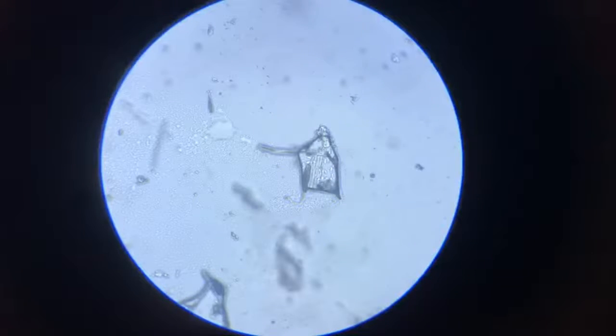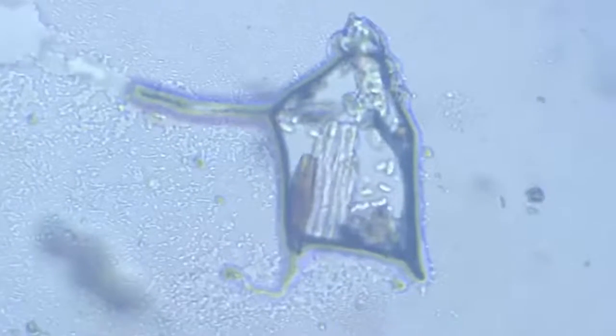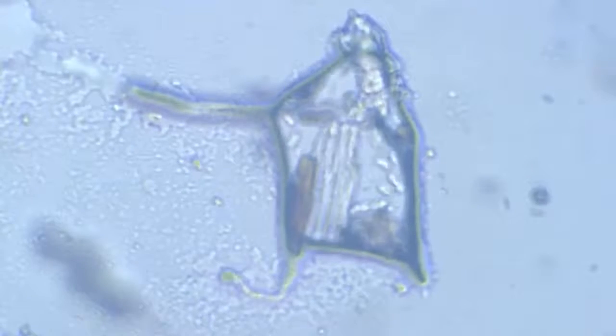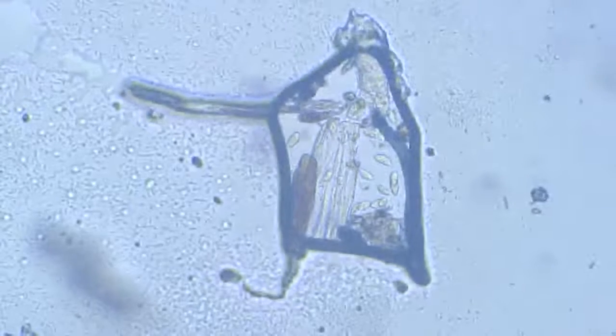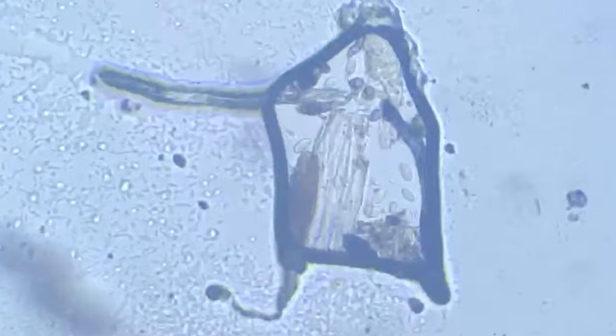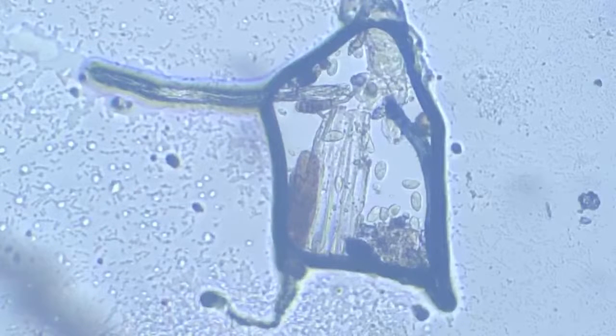Very often, when we do microscopy of live animals, protists, protozoans, and run it on a wet slide, there comes a time when water starts evaporating and the animals are trapped in small air bubbles, small spaces. It is at these places that a lot of action is concentrated. Here, the same thing is happening.